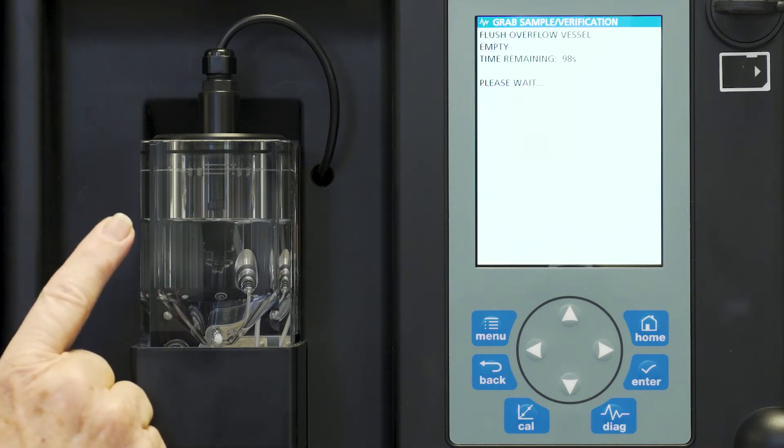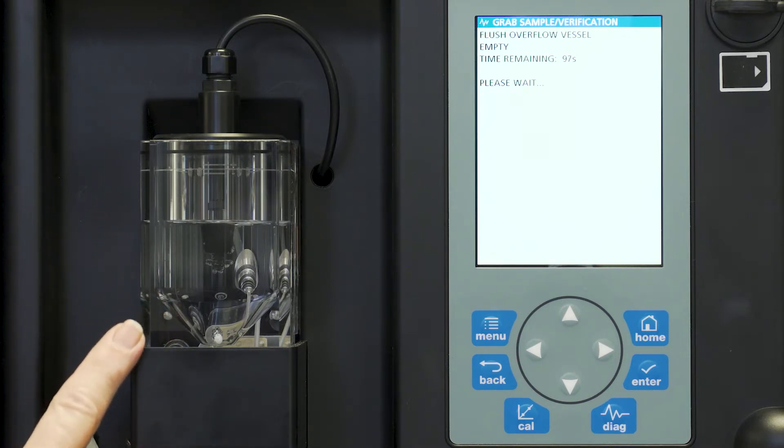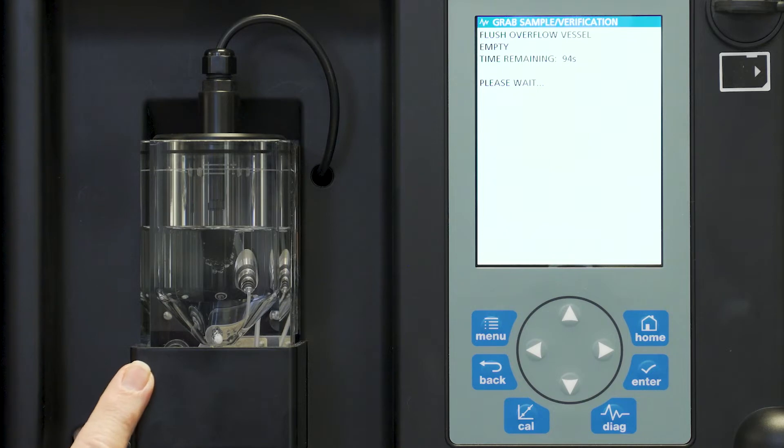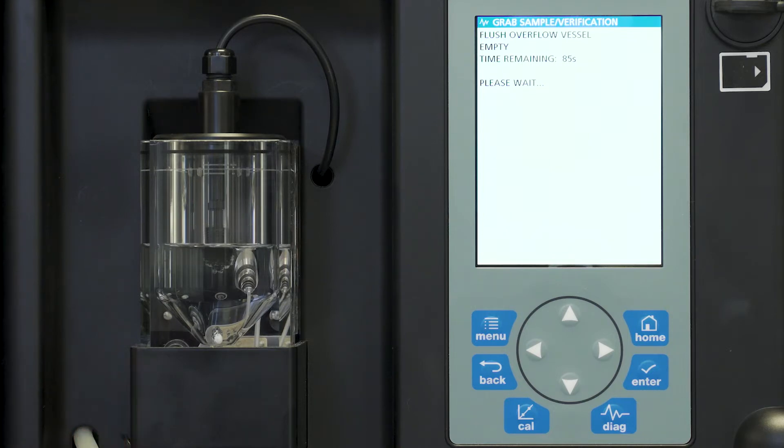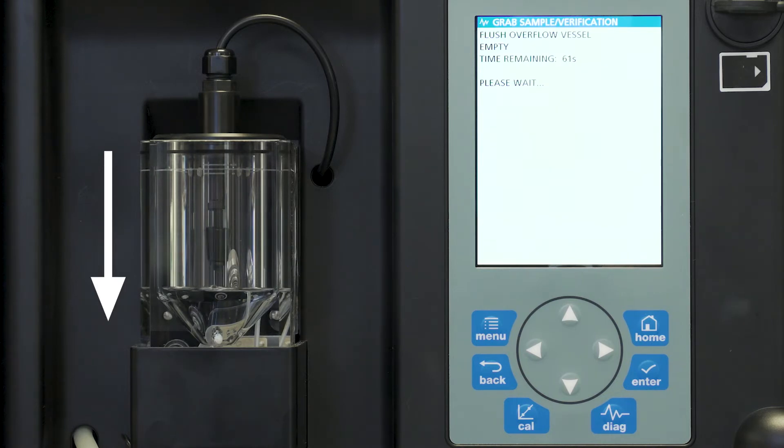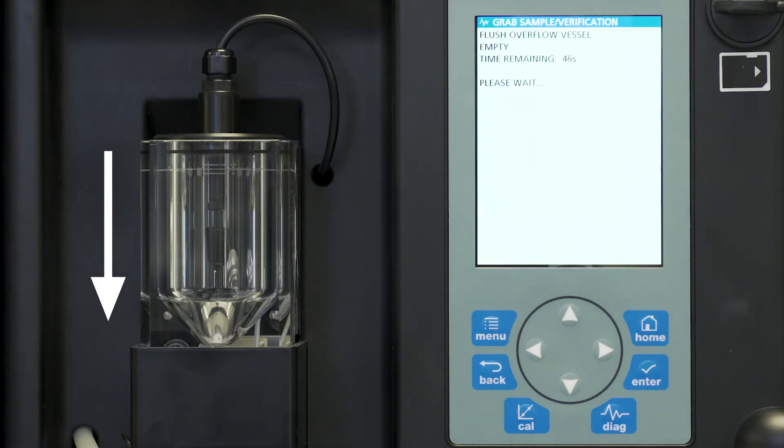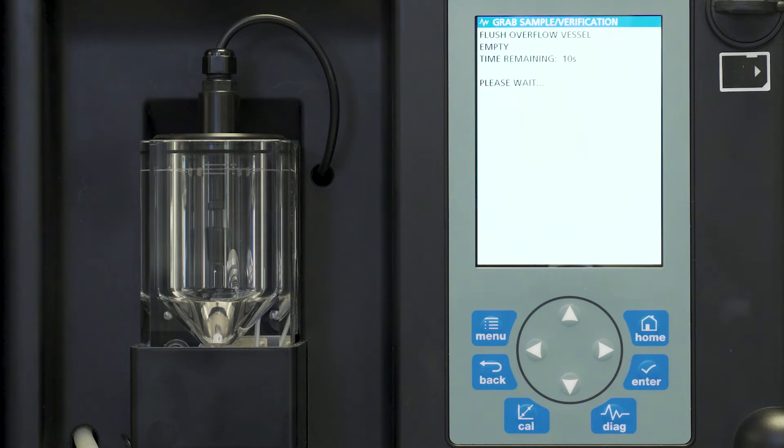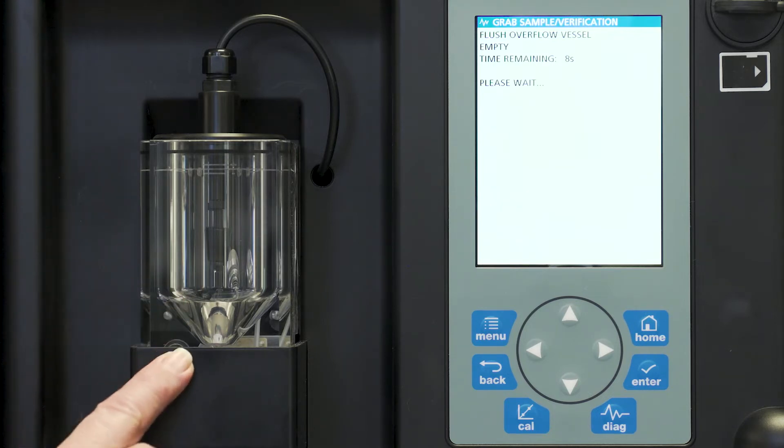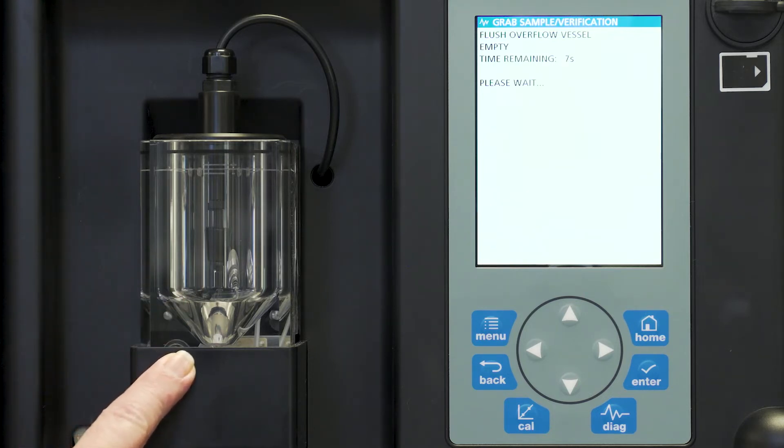So you notice that the instrument is slowly emptying the overflow chamber. You will notice that we have now emptied this overflow chamber.